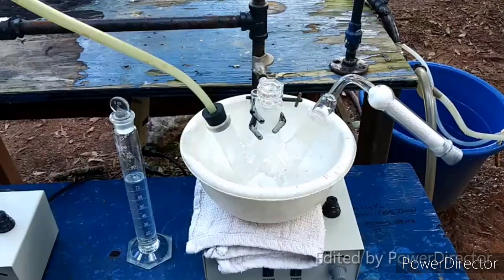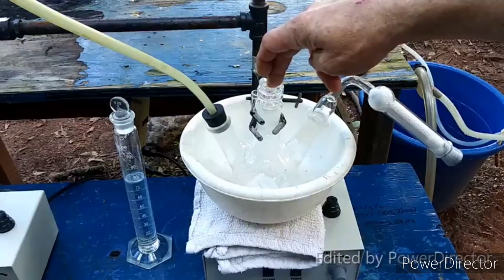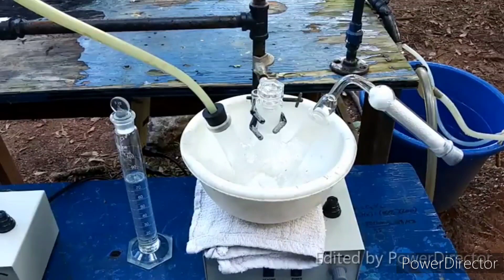I have everything set up to do the reaction here. There is 10.1 grams of stannous chloride in this round bottom flask. The protocol calls for 12 grams of the dihydrate, but my stuff is the anhydrous form. It has to be dissolved into 75 milliliters of 3 molar hydrochloric acid, and I'm really hoping it's going to dissolve easily without being the hydrate. Only one way to find out.